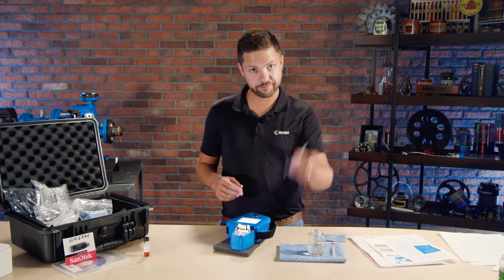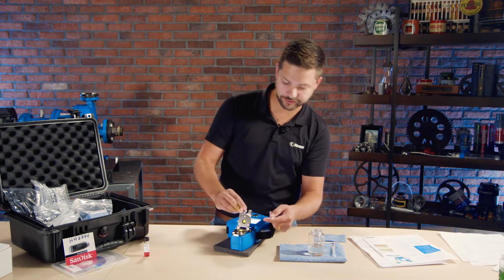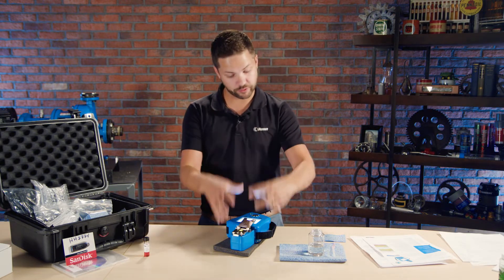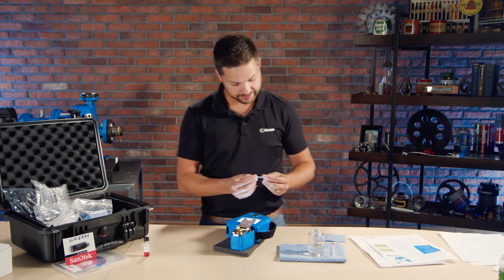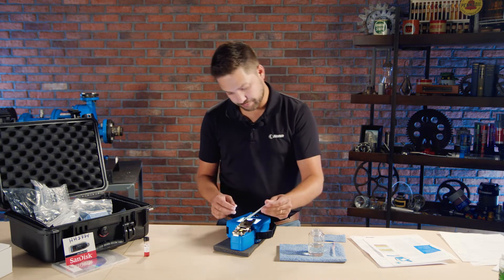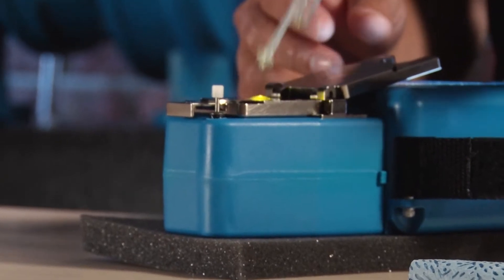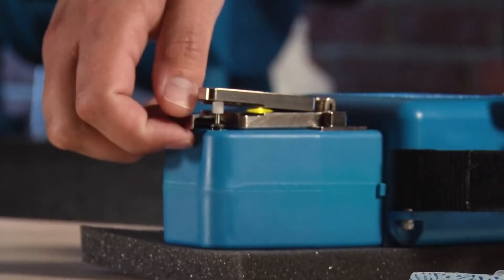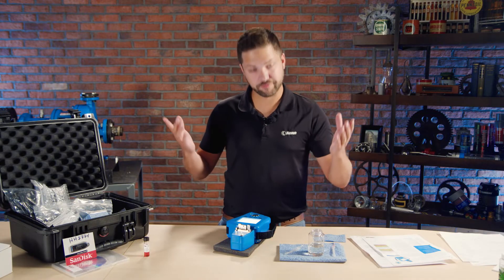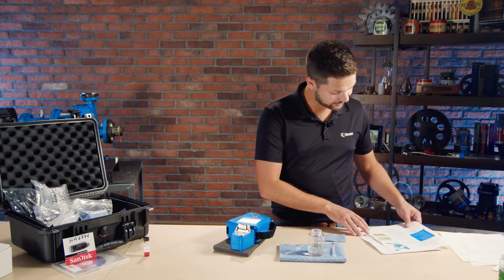I'm ready for the fluid I have here. I'm going to use one of these pipettes and open up this flip top. They have a nice little shock absorber here to make sure it opens up gently, and when you close it back together there's a perfect gap — all of that is well controlled in the design. So I put a drop of oil in. It was already cleaned from the reference fluid and it's already running. No problem at all.